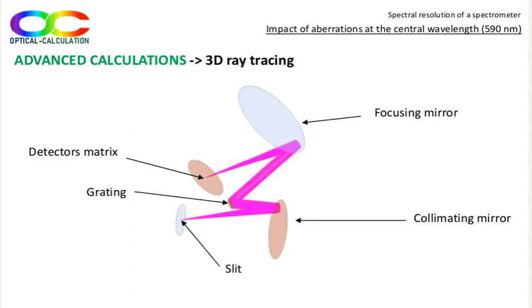Here is a 3D ray tracing with the slit centered on the focal point of the collimating mirror. The grating which is, for the occasion, replaced by a flat mirror because the software doesn't manage the gratings. The matrix of pixels is placed in a plane close to the focal plane of the focusing mirror. This layout is given for the central wavelength, which is 590 nanometer. As mentioned above, it is not the real layout.